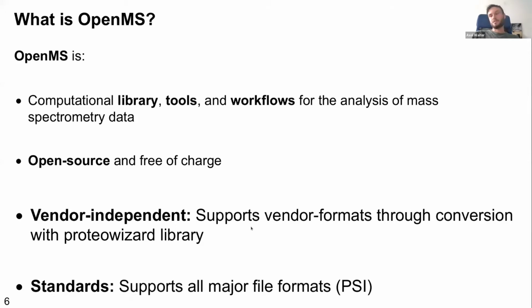For example, if you have Thermo .raw files or Bruker .d MS files, then you can easily convert them to the open format mzML with the ProteoWizard library using MSConvert.